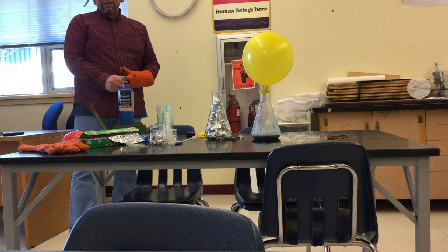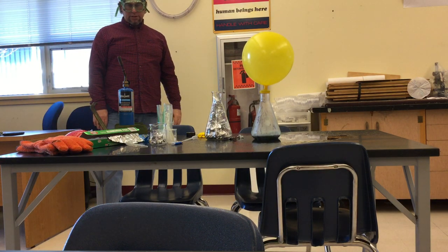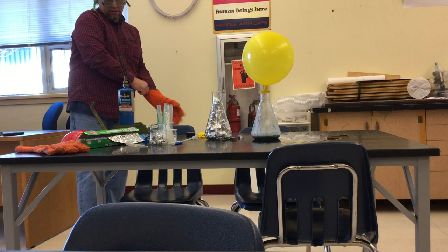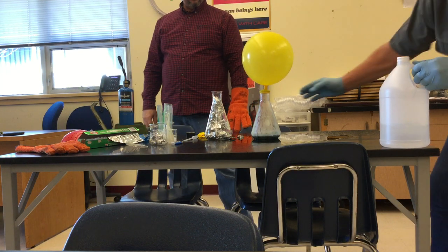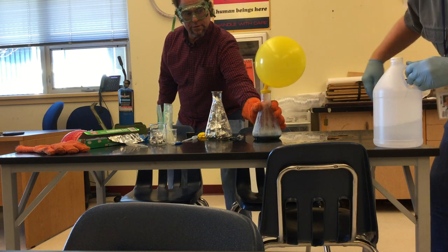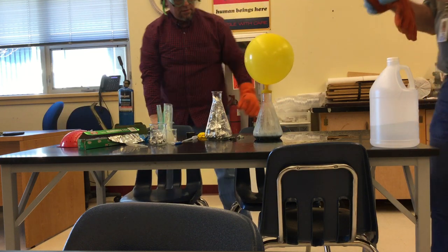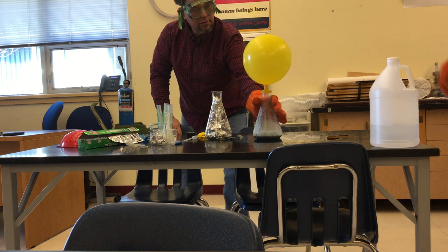Ammonia, hydrogen, nitrogen — that was a fun job. Our balloon is getting kind of big here. Do you have your sticks ready? I do. The balloon is hot. Just to get it off. That should cool off.